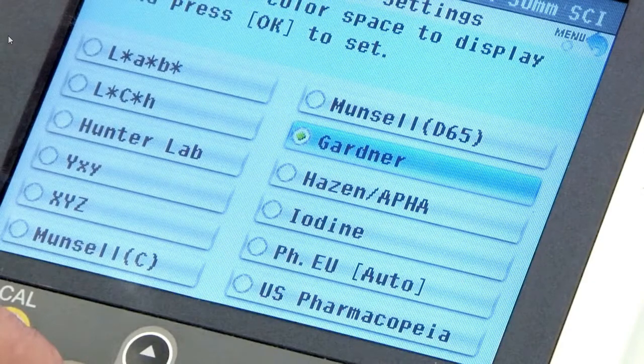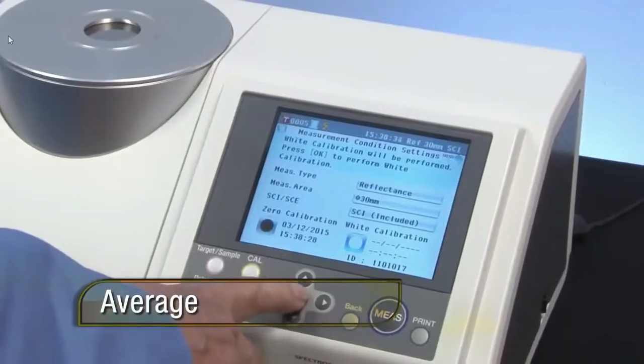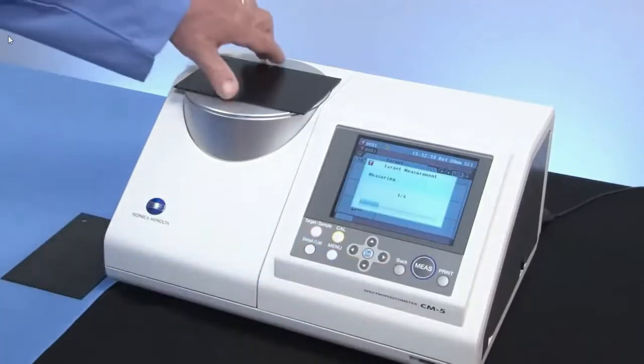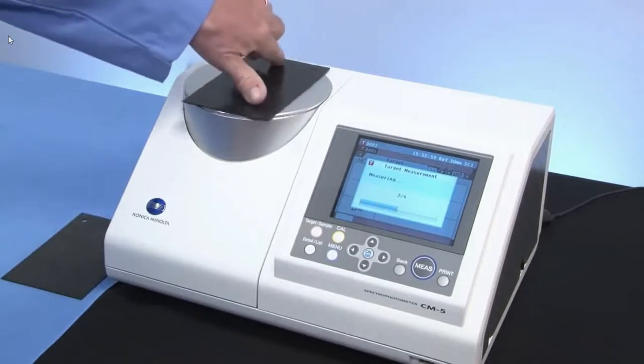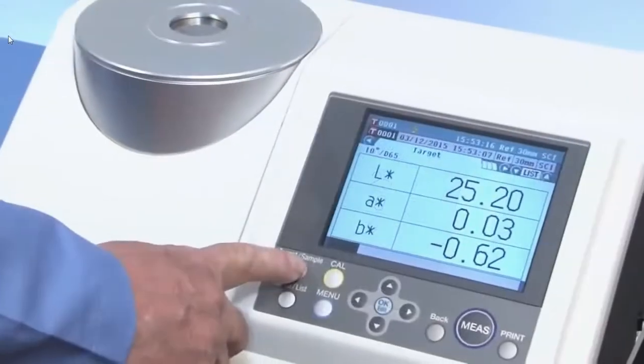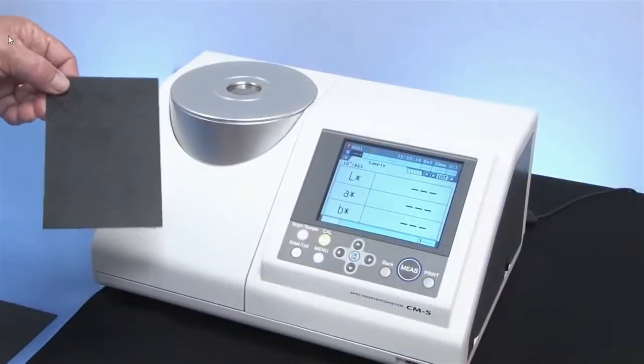The CM5 has an average measurement mode for textured materials. Calibrate, set the auto measurement, and turn the sample while automatic measurements are being taken. This setting is also used with color difference. For color difference, measure the sample color and the standard color, then save the values for each measurement.